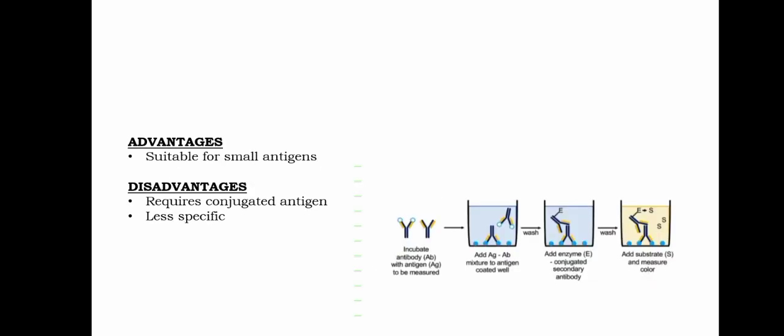The advantages of competitive ELISA include that it is suitable for small antigens, and the disadvantages include that it requires conjugated antigen and is less specific. This is a picture representing the procedure of competitive ELISA.